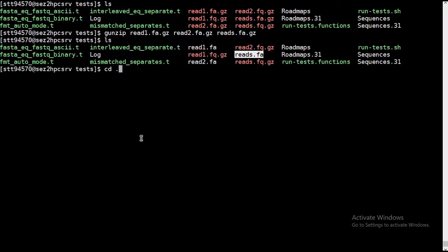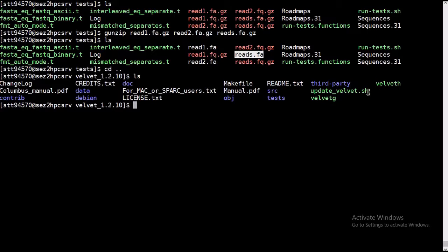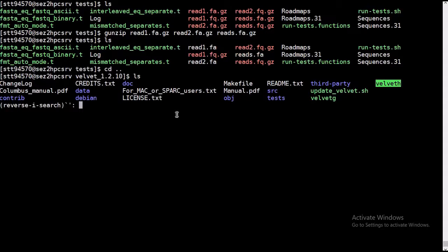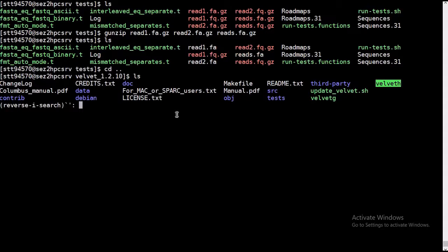So we are ready to check the installation. We need to fire the velvet command. Check, and it's done. It's running fine.